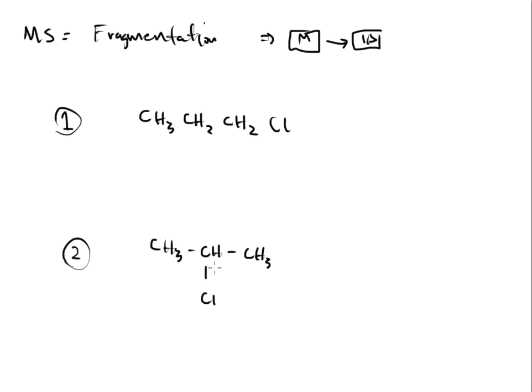And we said we have to look at the fragmentation pattern. The fragmentation patterns are going to be very important because that will help determine which exactly one of these I have. So the very first fragmentation pattern that we're going to talk about is the alkyl halides.